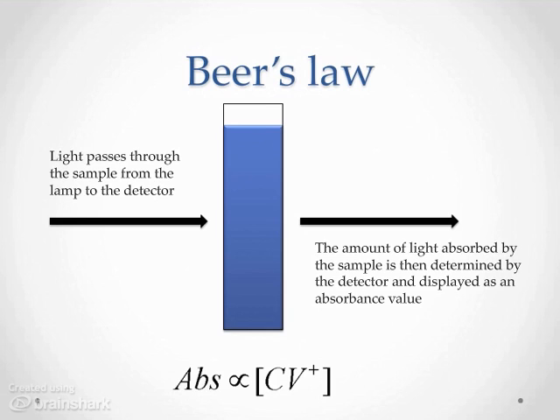You're using up that reactant, so you'll actually literally be able to see your reactant being consumed in this reaction, which is very useful to us because we know from stuff we've done in 103 that absorbance is proportional to concentration. So we can say our absorbance measurements are going to be proportional to the concentration of crystal violet that we have in our particular sample.